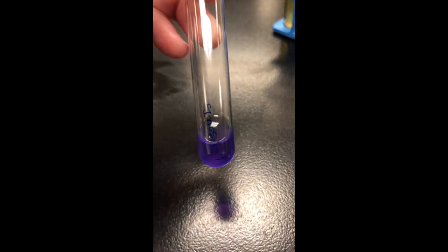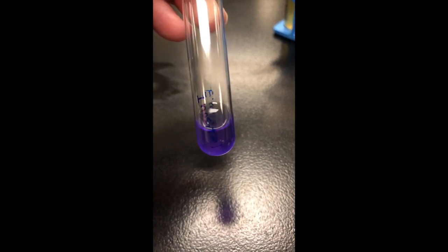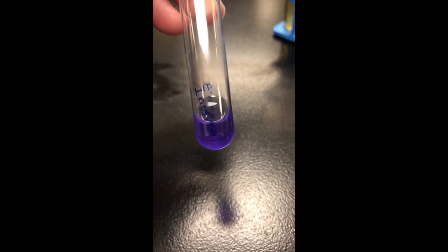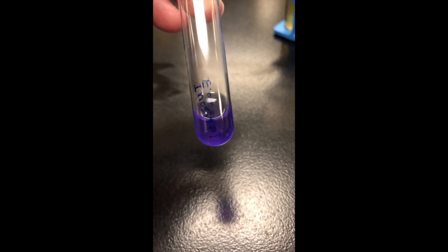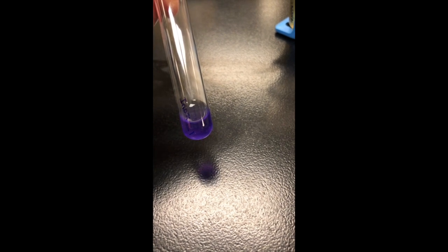Now, E. coli could utilize lactose, but for some reason, our inositol is still purple. So E. coli can't utilize inositol for energy. What do you think about your unknown? Is it yellow?